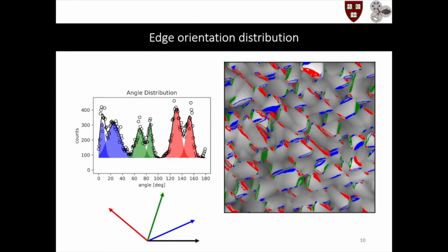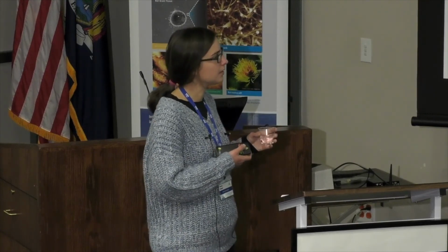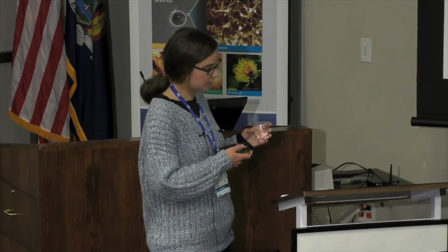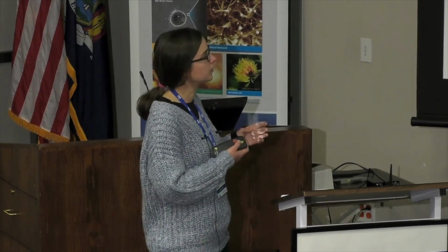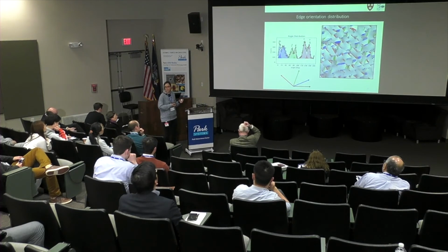But how does one decide what edge angle it is when it's one isolated point or a couple of isolated points? I would have thought it would be hard to know what the angle is of a single point. Yeah, there is some noise, definitely. So I tested the method also on a synthetic image of triangles, and we still get a spread in the preferred orientation. So there's some error in there.